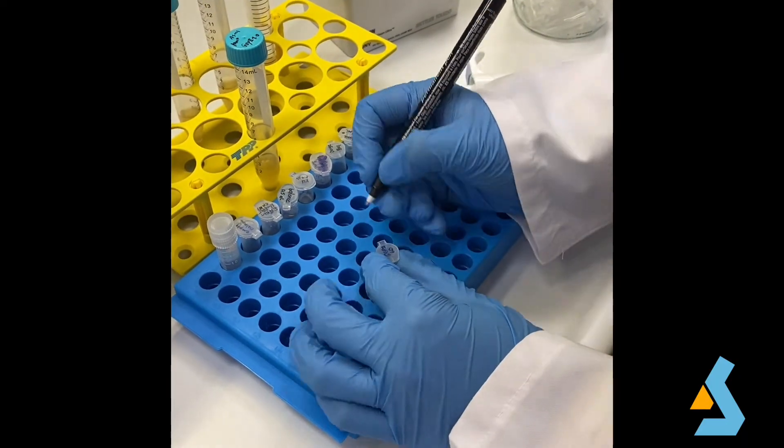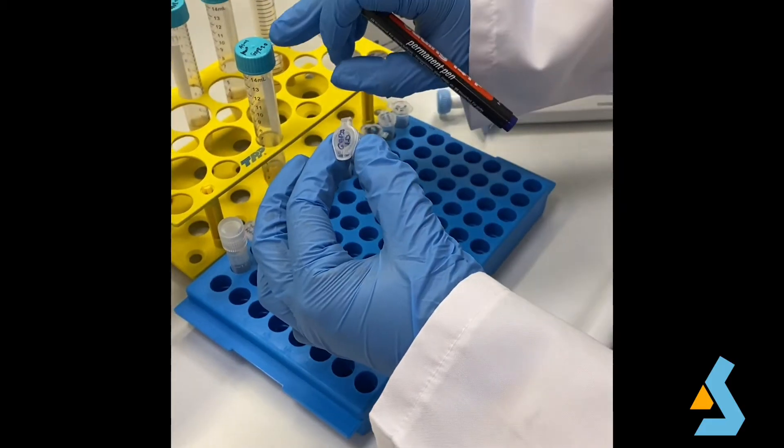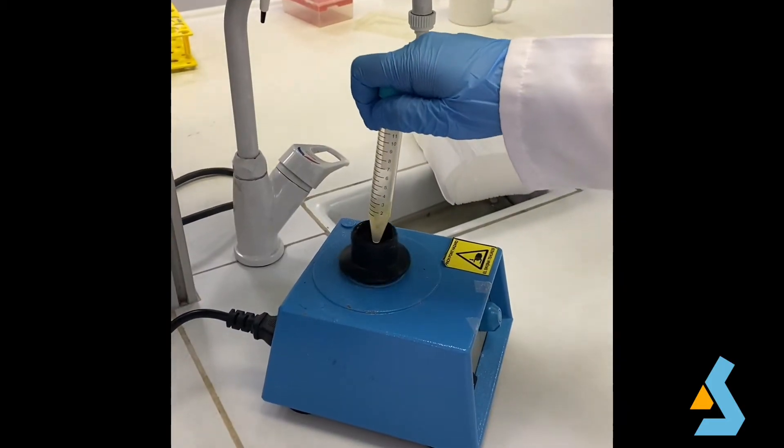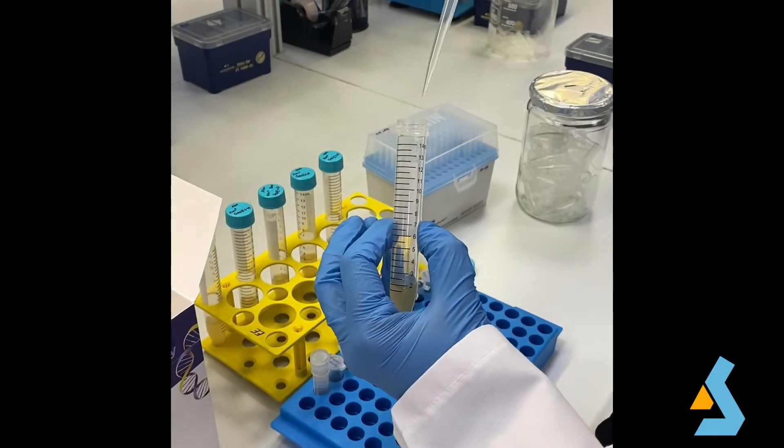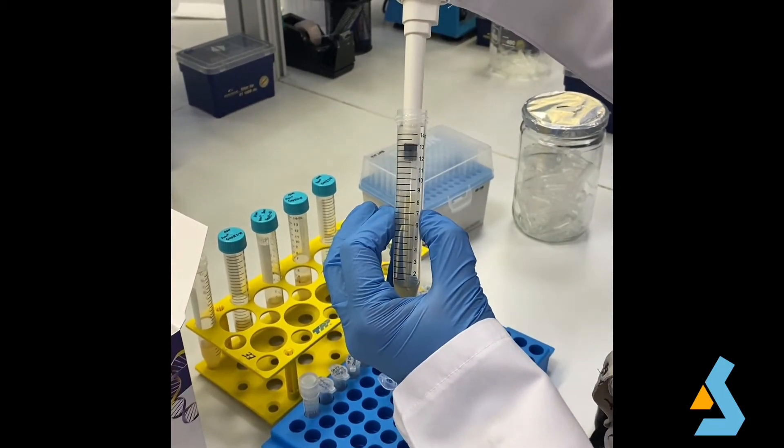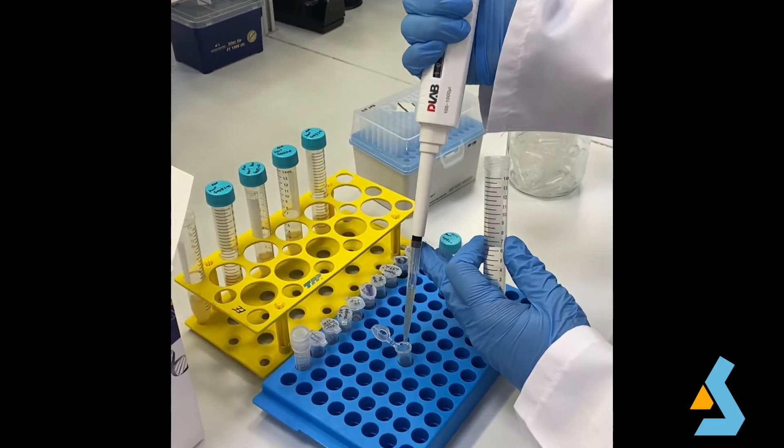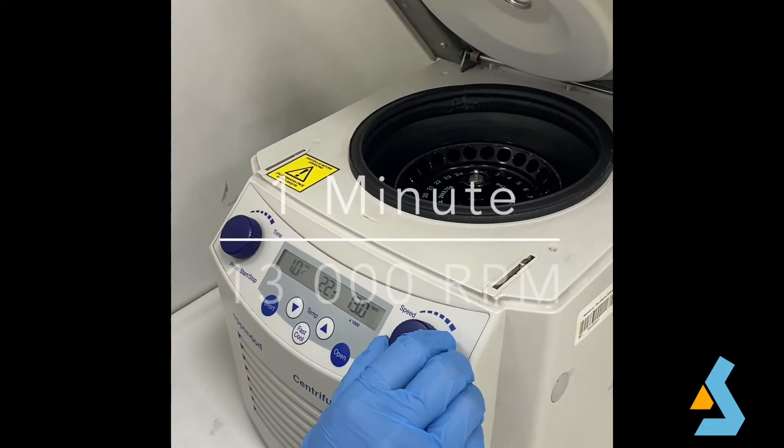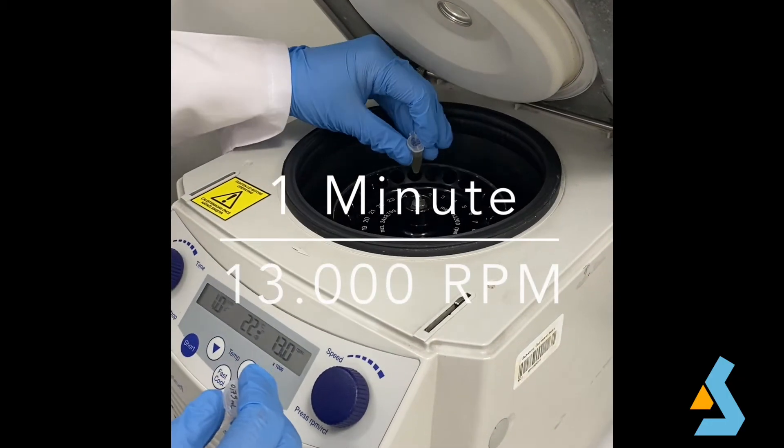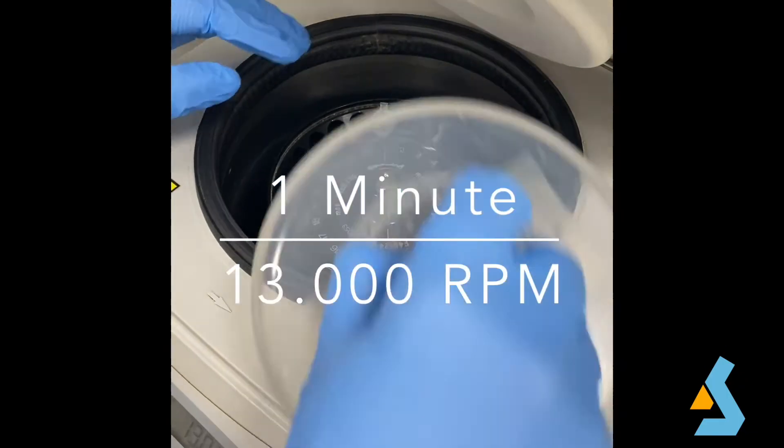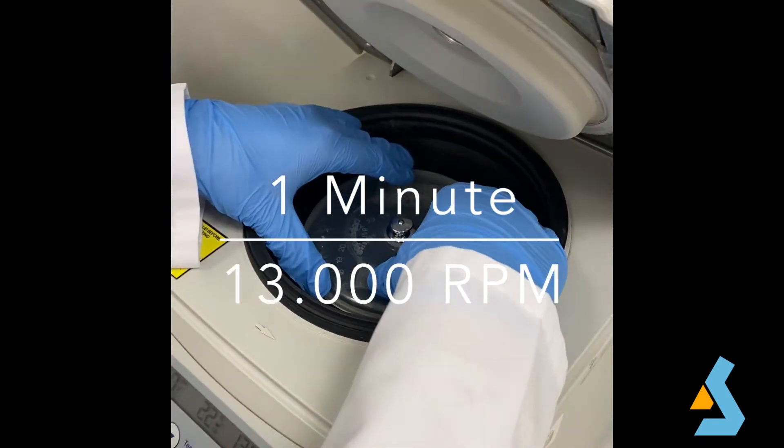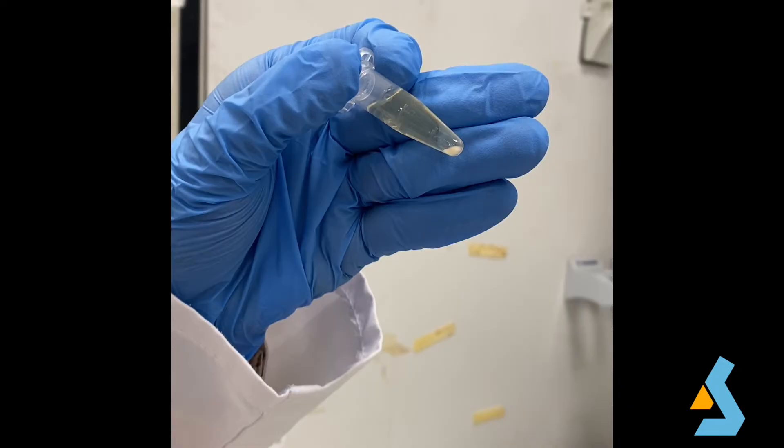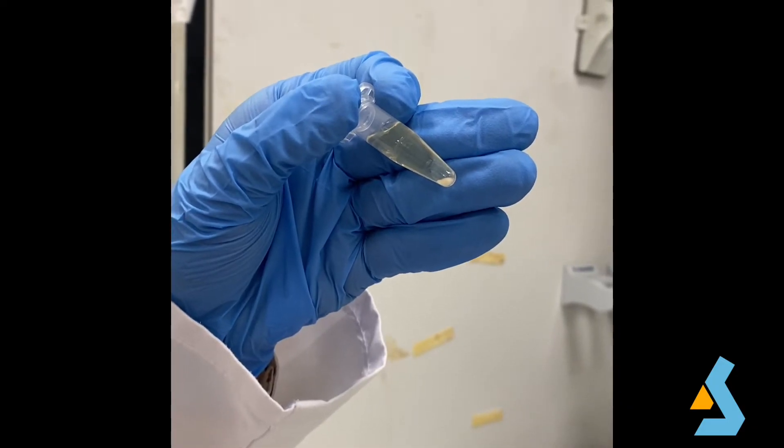Firstly, we need to label a microcentrifuge tube according to the name of the culture. After vortexing the culture briefly, 1 milliliter of bacterial culture is added into this tube. And then the tube is centrifuged for one minute at 13,000 RPM. Following the centrifuge, the pelleted cells are obtained at the bottom of the tube.